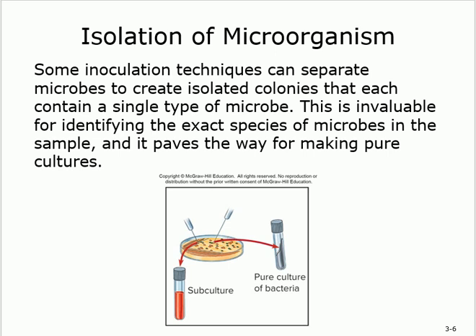Most of the time we cannot do it like that. But if that is done, you call that a pure culture. So what's a pure culture? A culture that contains one species only. Clear? If that's the case, you're done with the isolation because you didn't need to isolate in the first place. You inoculate, and this is not easy to do. It's kind of complicated to get one organism and put it in the medium and allow it to grow, and this is the only one that you see. This is called a pure culture, which is not that easy.